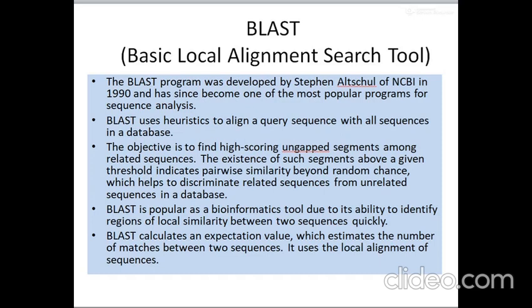It uses heuristics to align a query sequence with all the sequences in the database, and the objective is to find the high scoring ungapped segments among the related sequences. The existence of such segments above a given threshold indicates pairwise similarity beyond random chance, which helps to discriminate related sequences from unrelated sequences in a database.